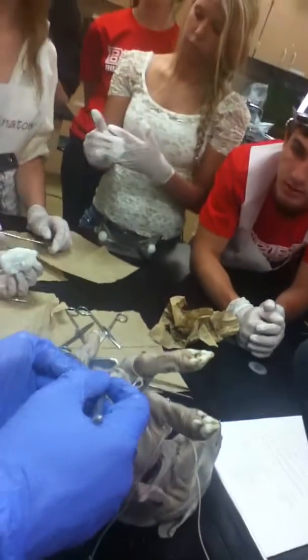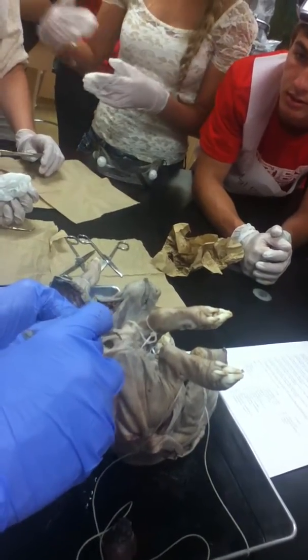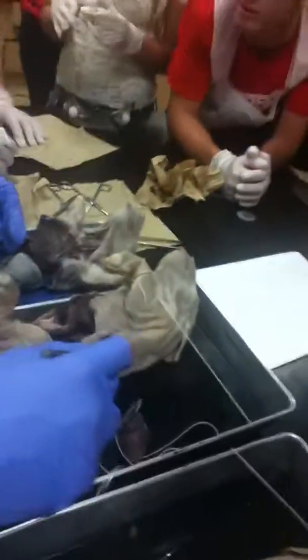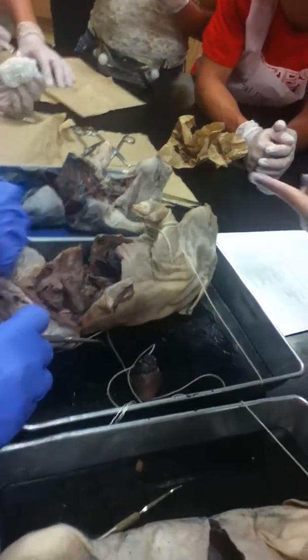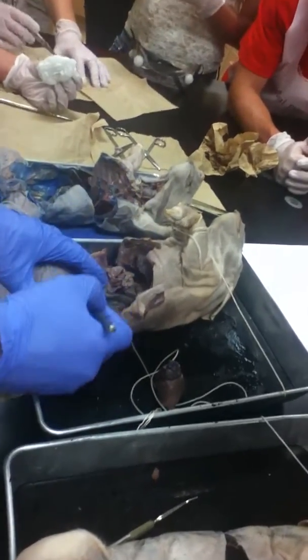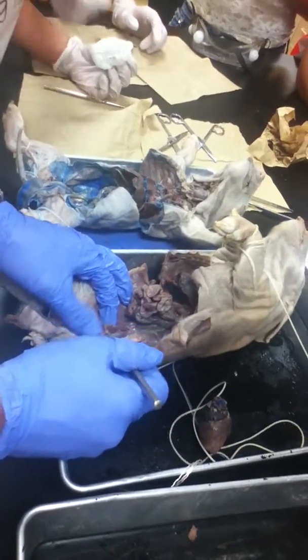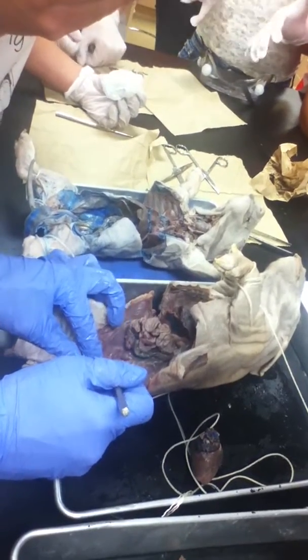In the female, the urogenital opening is going to be right here, right down there. It's the urogenital opening. Female, that one's tail is just straight off. Ovaries, the bean-shaped structure at the end, that's going to be the ovaries. Right there is an ovary as well.